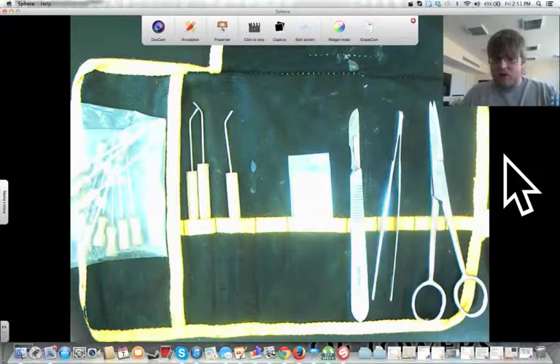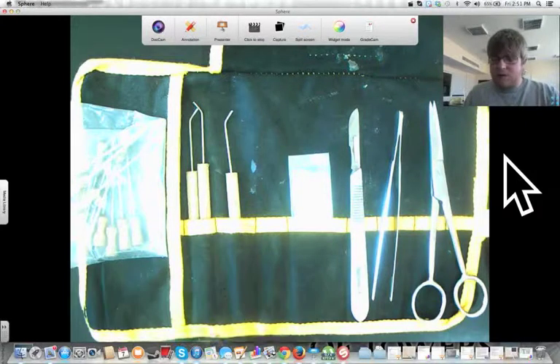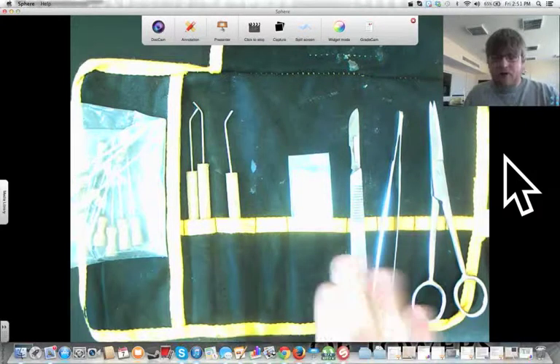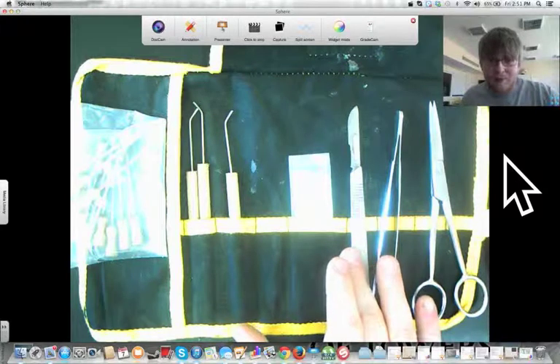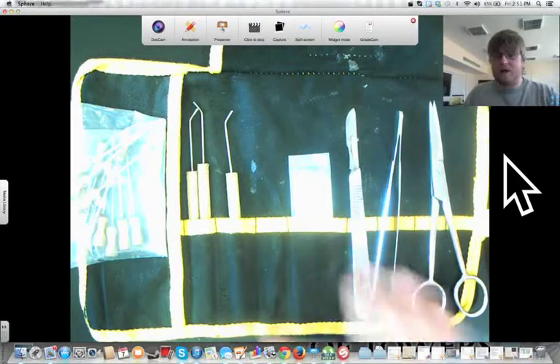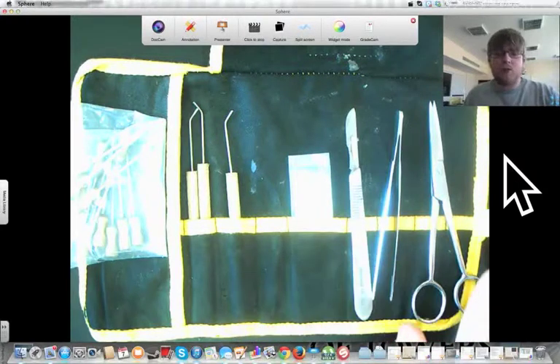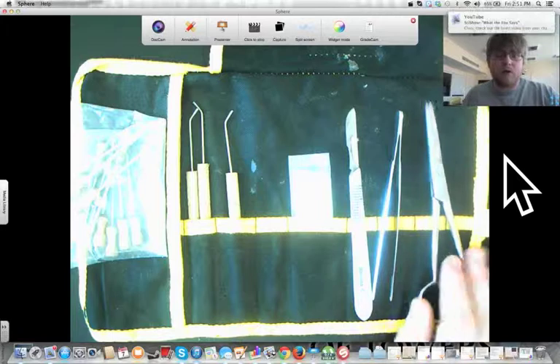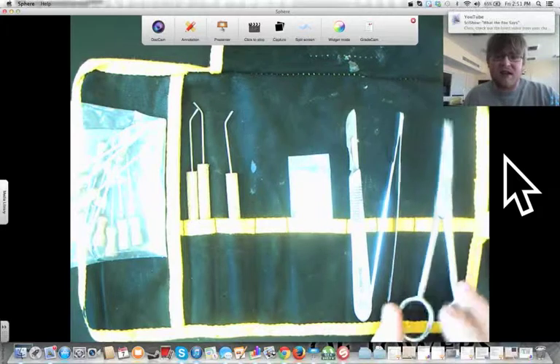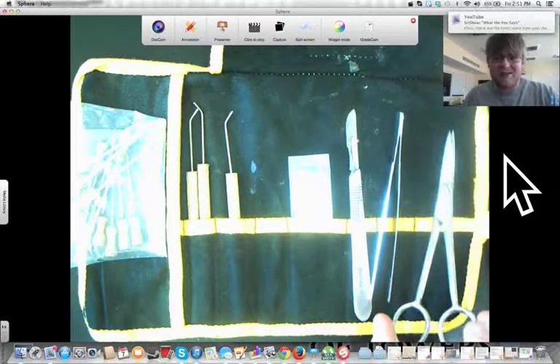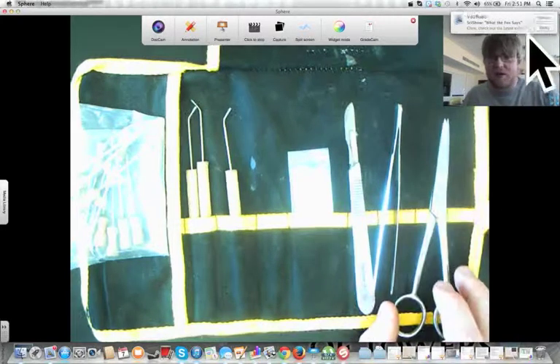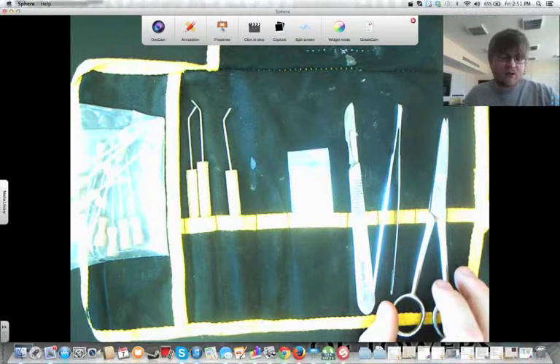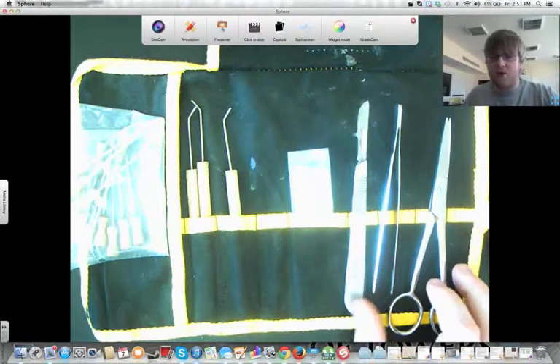I know that most people are going to want to go for the scalpel first when you want to cut something open. But in reality, what you should be using most of the time is scissors. If we're doing something like a kidney dissection, then yes, a scalpel would be appropriate.